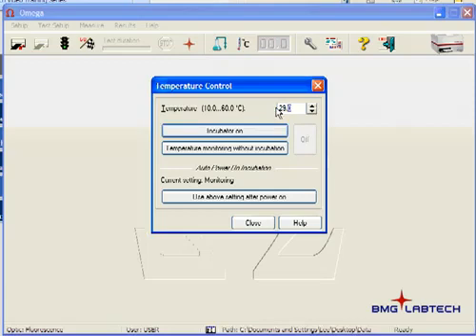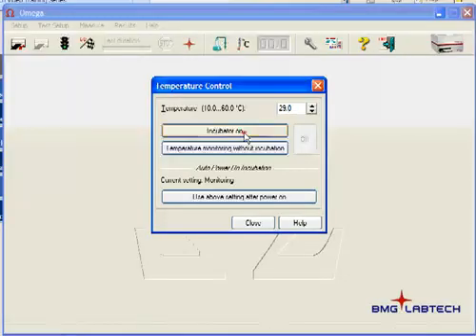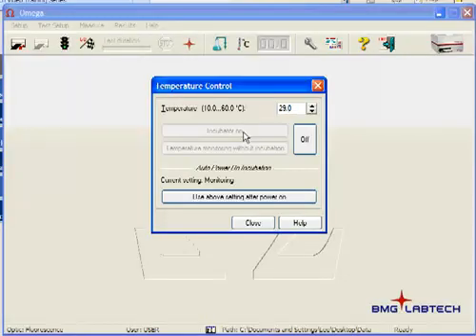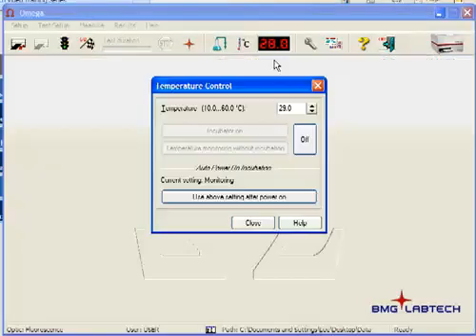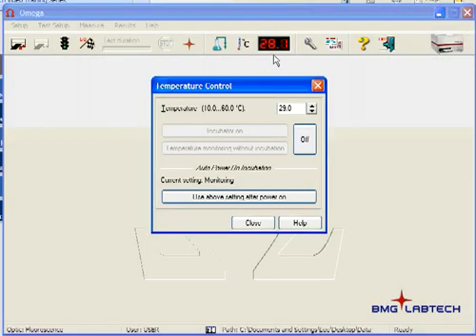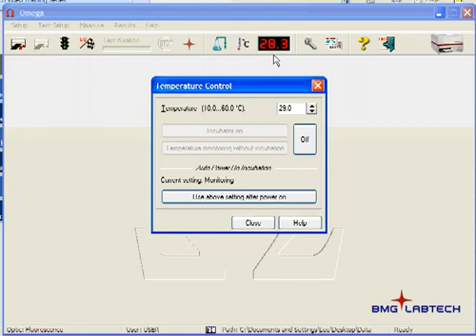and say incubator on. Now you'll see the incubator temperature in red, which means it's actively changing the temperature until it hits 29, and then it will turn green to let you know that it's ready to be used.